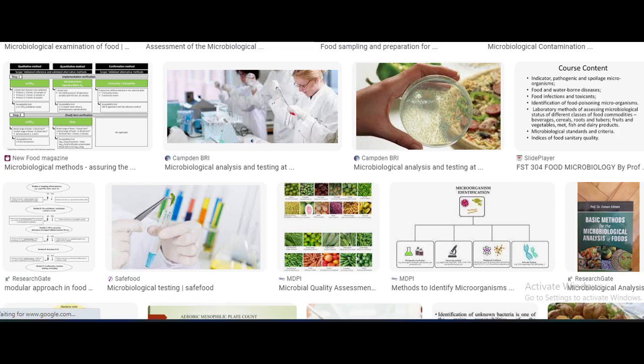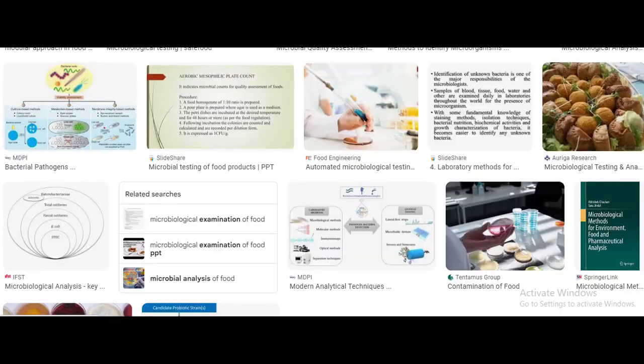That is why the rapid tests come out. That is why the alternative tests, also called rapid tests, now come. Number one of them is the dye reduction test. Very rapid. Just take something from the food you have gotten and add it. Immediately the result will come out. And it is still based on the cultural methods, on the knowledge.